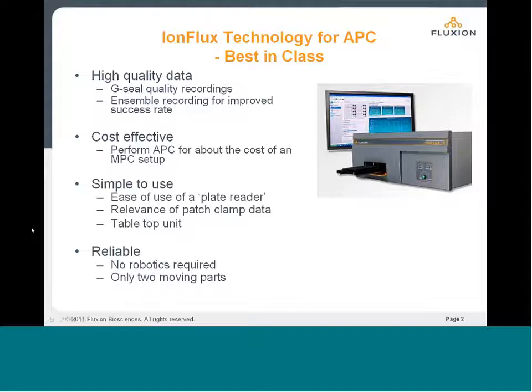The system is simple to use, and again, the focus today will be walking through those steps in the operation to get a feel for what it's like to control the system. Not only do we have a much smaller instrument with much more of a plate reader type look and feel, but we've been looking to achieve the same within our software interface.